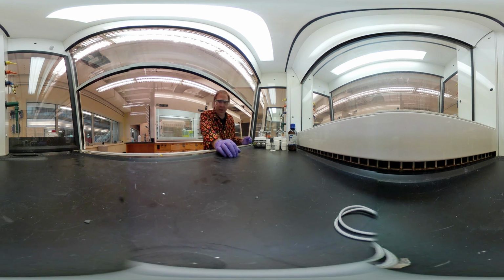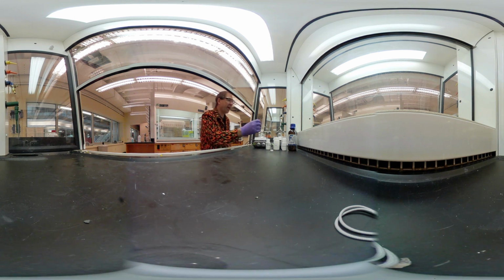So we need to oxidize this. And you can oxidize in several different ways. You can use just oxygen gas. You can use something like hydrogen peroxide. Or we're going to use something called oxone. And I've pre-weighed my oxone here. So I've got just about 1 gram of the oxone. Okay, so add that together.